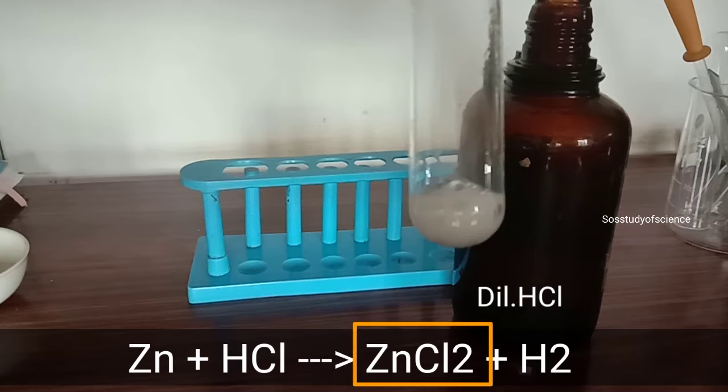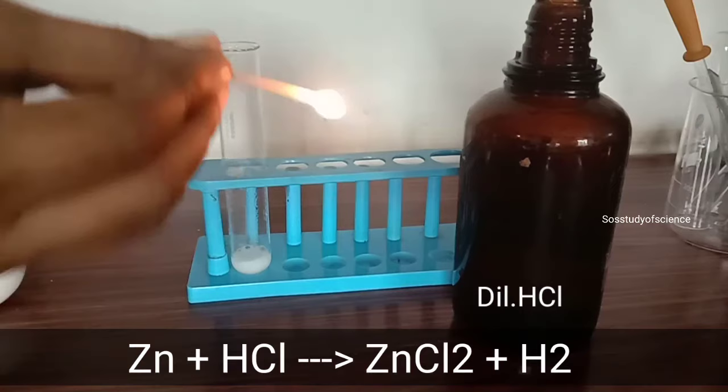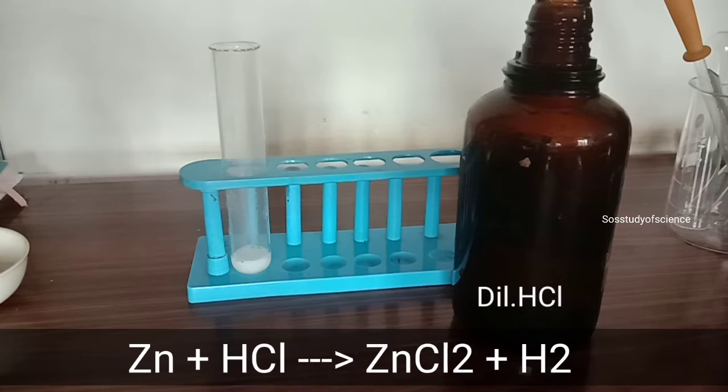Now let us perform a test to identify the gas liberated. Take the flame of a matchstick near the test tube. Yes, I hope everybody heard that sound — it's a pop sound. When hydrogen gas is liberated, we can hear the pop sound.